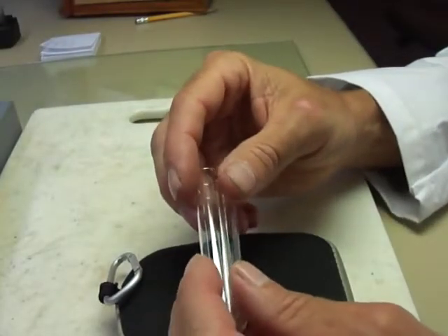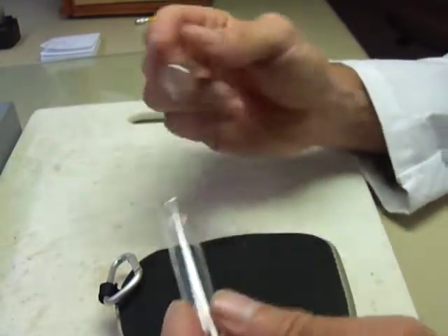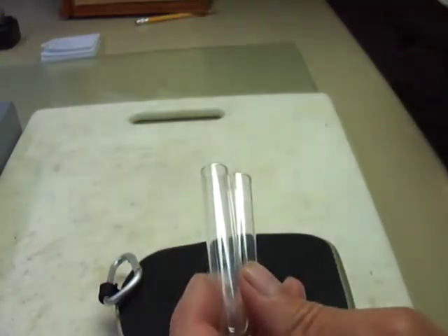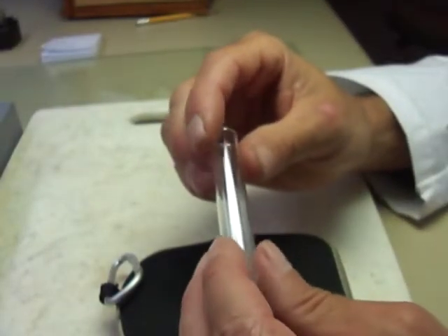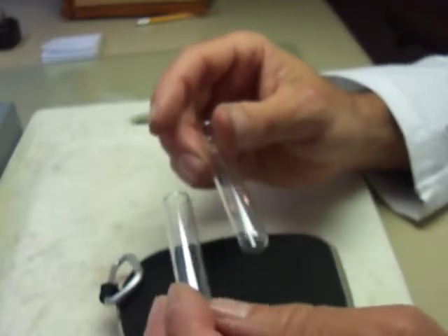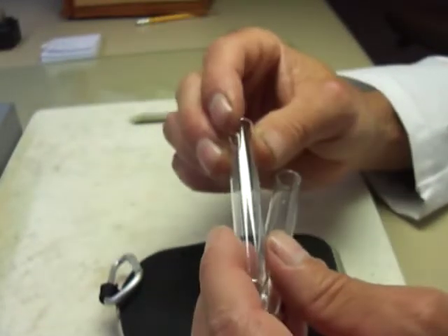I cleaned up both of the test tubes that I heated with acid — one with just the plain acid and one with the acid and the mineral. I cleaned them out with a test tube brush, rinsed them really well with deionized water so there weren't any water spots, and also put some acetone in there to dry it out and even heated them, so they're clean and dry.